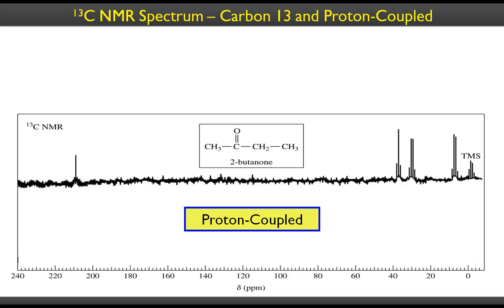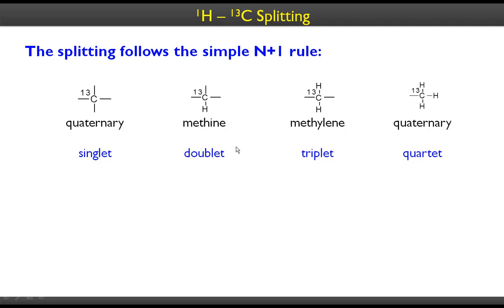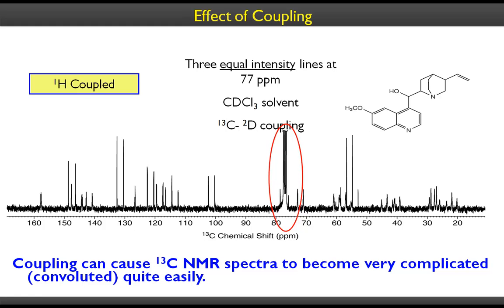But however, this is only useful in a simple molecule like this. If you have a complex molecule, we already talked about this. If you have a complex molecule like this, codeine, I think it's quinine kind of compound, the peaks are overlapping here because of the splitting. Each carbon is now further split because of the hydrogens, and there are too many hydrogens and too many carbons, so it kind of overwhelms. It becomes detrimental instead of helping us, right, to analyze the different types of carbons. So the proton coupled NMR are quite useless here. It gets pretty busy pretty quickly.